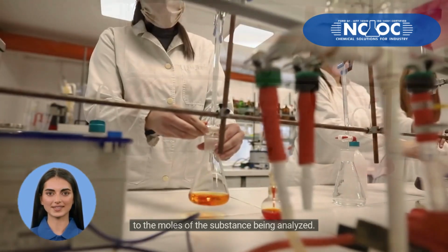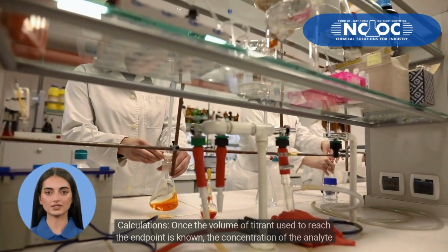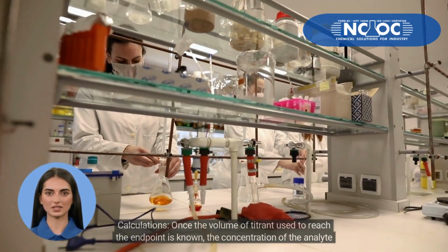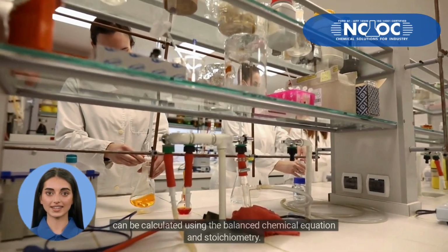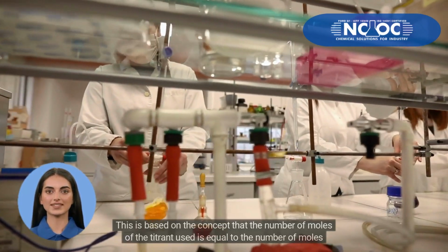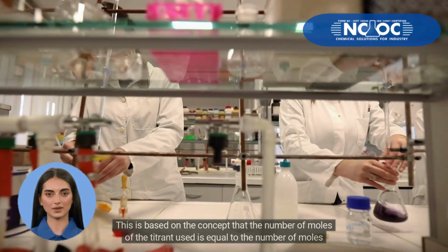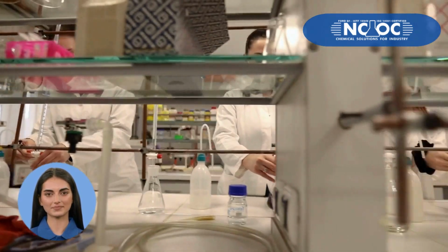Calculations: once the volume of titrant used to reach the endpoint is known, the concentration of the analyte can be calculated using the balanced chemical equation and stoichiometry. This is based on the concept that the number of moles of the titrant used is equal to the number of moles of the substance being analyzed.